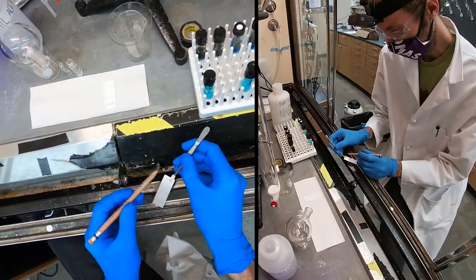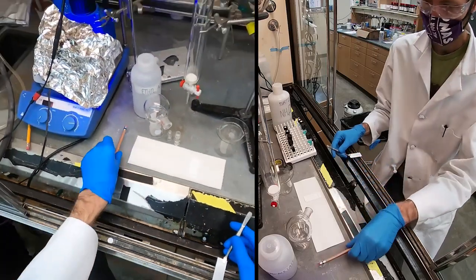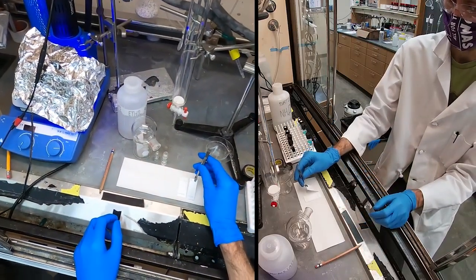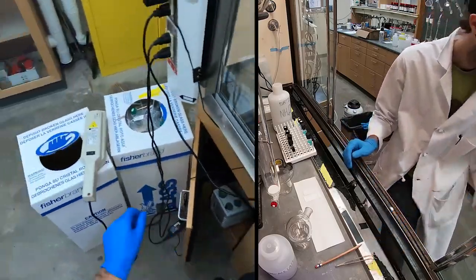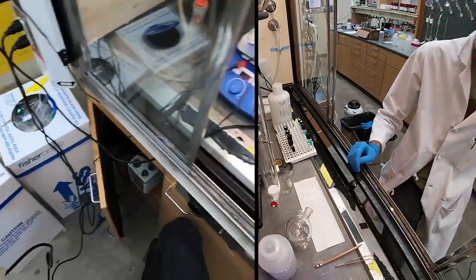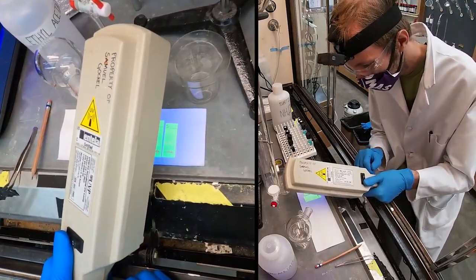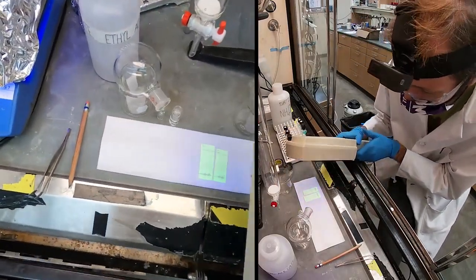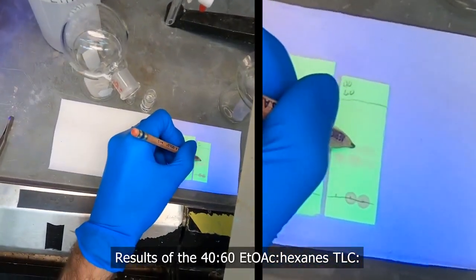So here's our 40% plate. We'll see if that delta RF is exaggerated. Most of the time it doesn't really work out that way, but sometimes you get lucky. So in this case it actually looks like they almost got pushed closer together.